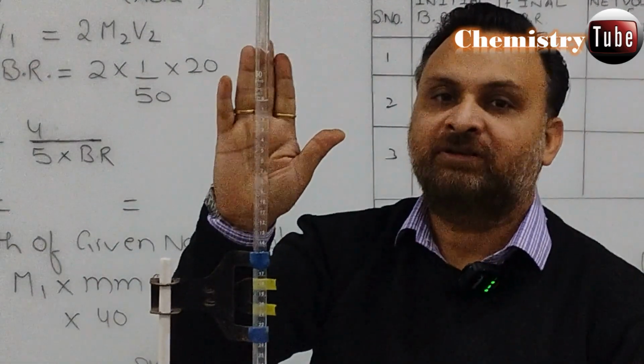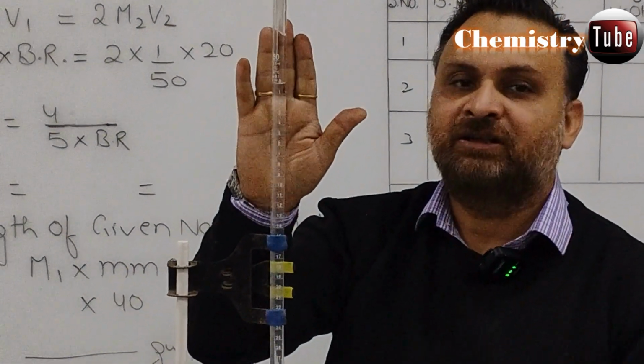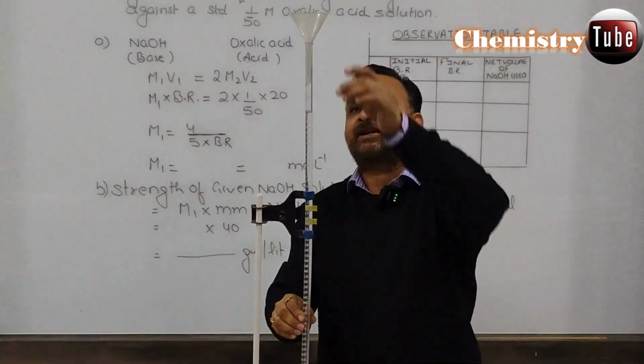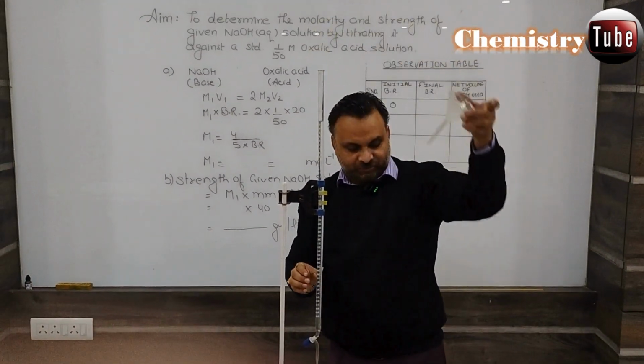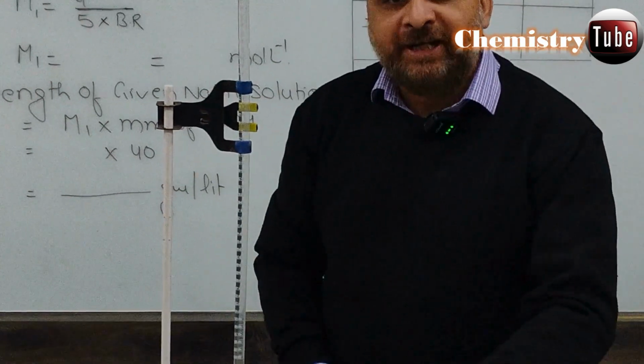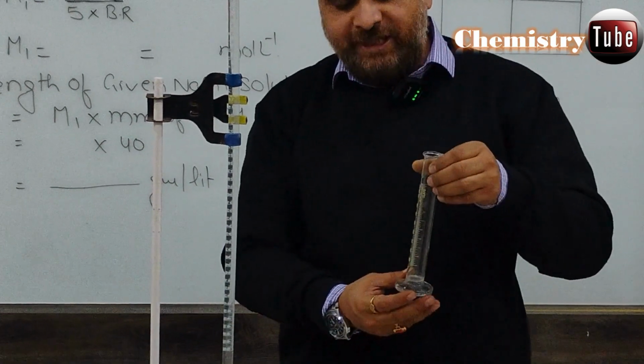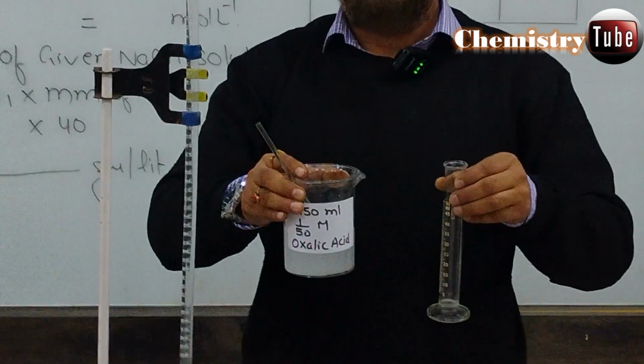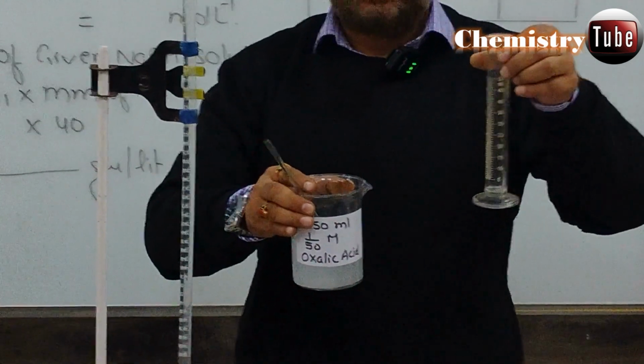Is it visible? Okay. Now this burette is ready for titration. Let us get rid of this funnel.